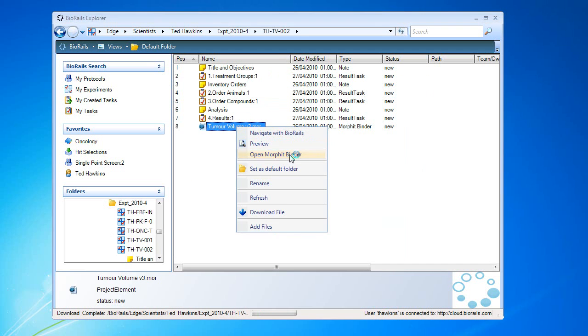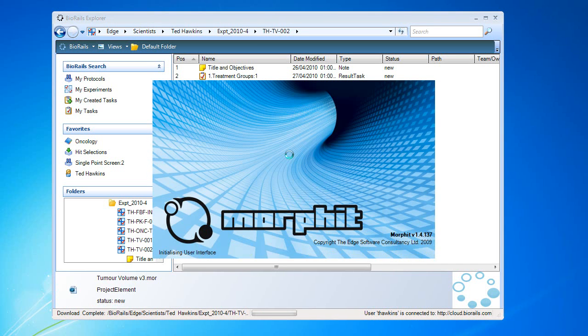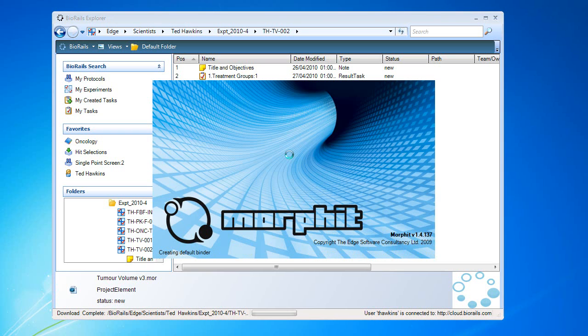We can open the Morphid binder and execute the experiment. Morphid is the multi-dimensional spreadsheet. This is based on a template. As it opens, it will connect and we can run the experiment.